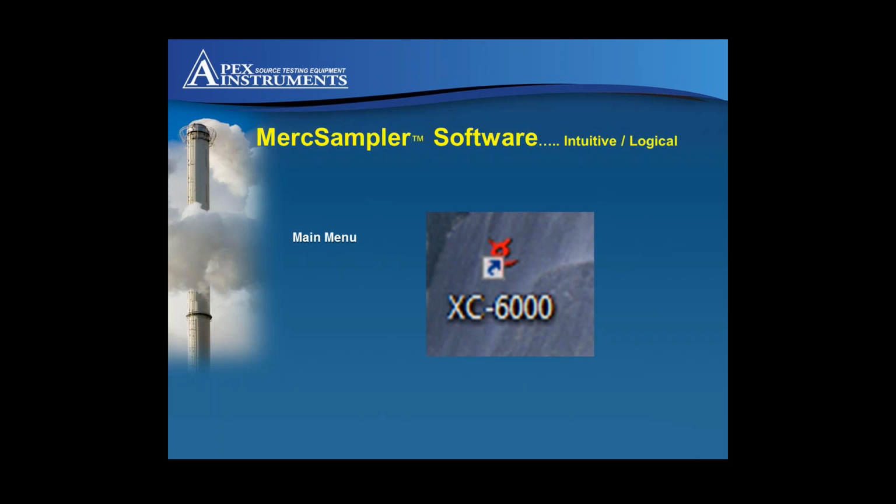If you just wanted to view what's going on, you could actually use our software to view it. You could export it during its operation too, and the data is also being brought into the DAS at the same time. It's very versatile communication-wise, IO-wise. You can use Modbus to talk to it, and at the same time provide an analog 4-20 if you so choose, or a flow, or a pause for like the boiler. But the same thing is capable via the Modbus too. So it's very versatile on the IOs and the communication side of it.